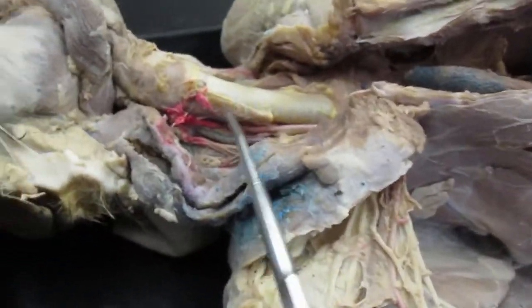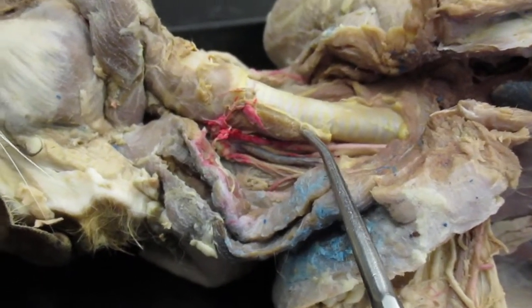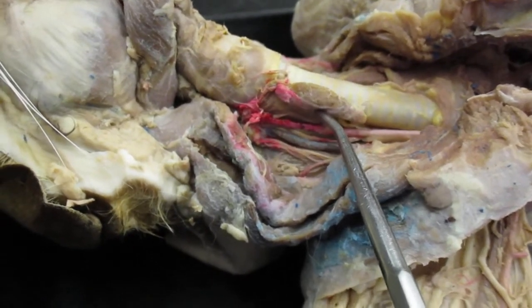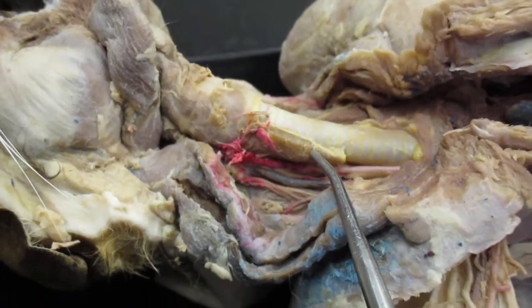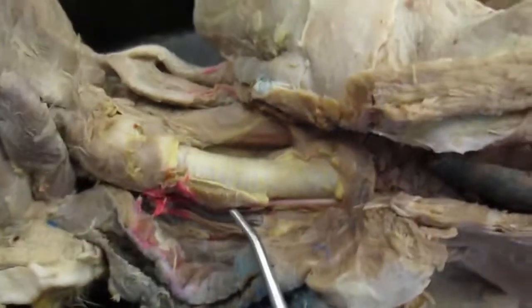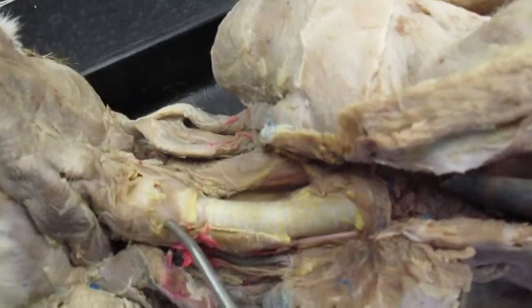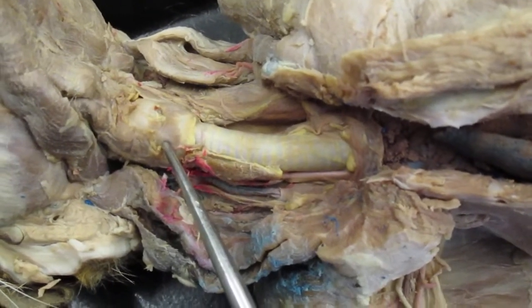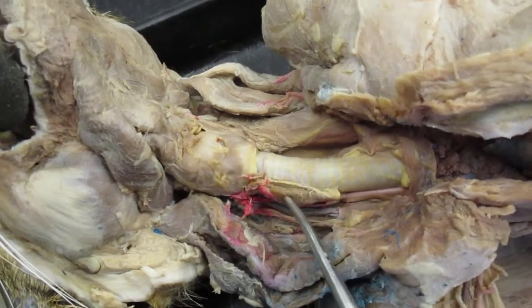And we can see the thyroid gland right here on this next cat. It's a little bit better picture here. So here's your thyroid gland. Right there. Thyroid gland. And this is, again, your cricothyroideus muscle, trachea, thyroid gland.